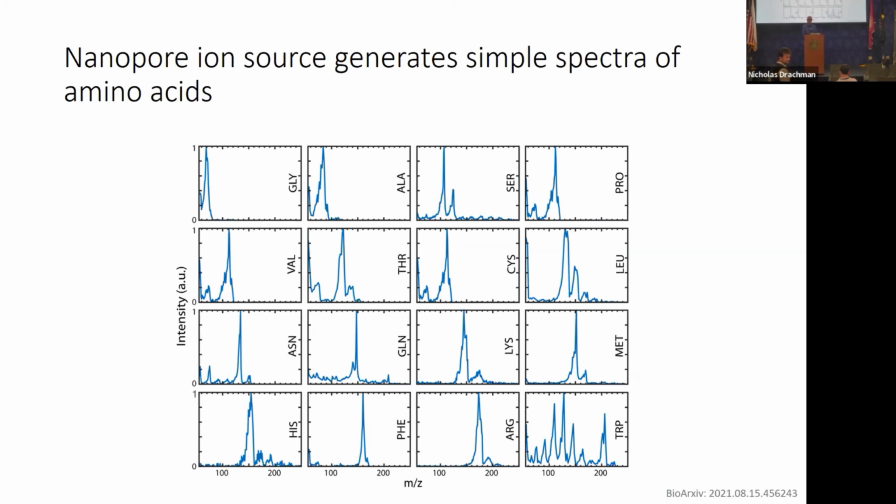So how do you deal with this? I assume these are very clean amino acids that you dealt with, but any sample that comes from a biological experiment typically has a lot of junk or matrix components that are not ionized. So how would they not cause problems once they get inside the mass spec?